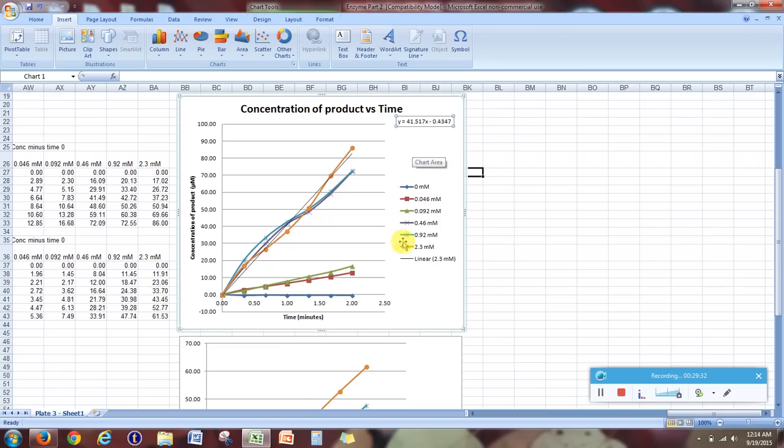So one thing that I like to do, because it is so critical that you don't get these out of order regardless of what your data looks like, I like to just drag these off to the side so I can keep track of them. So let's see, next one was this red one. Oh, sorry, no, we're going from bottom up.